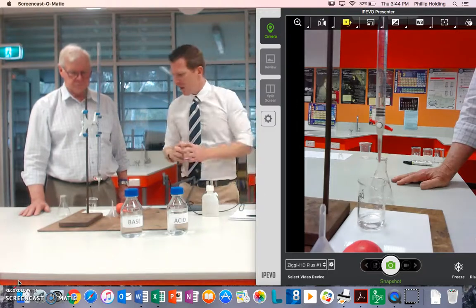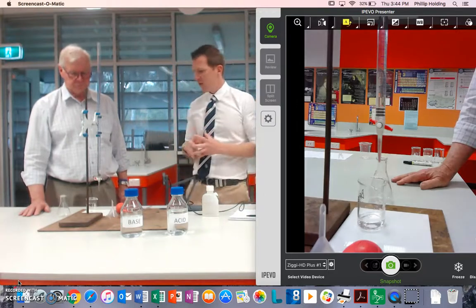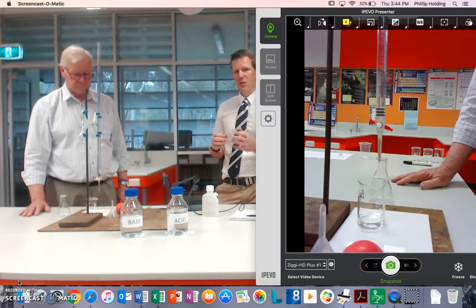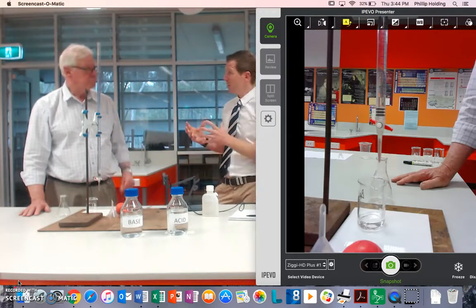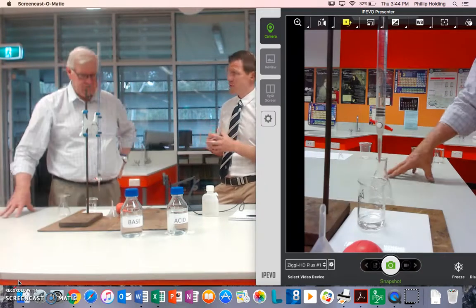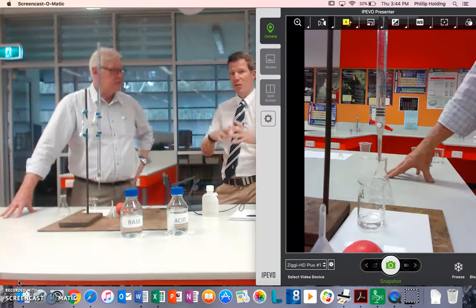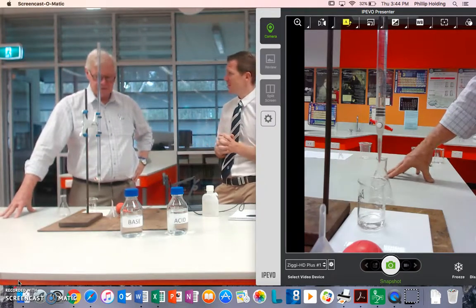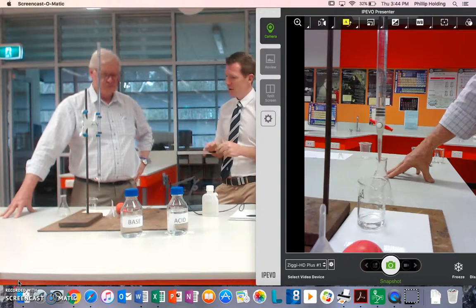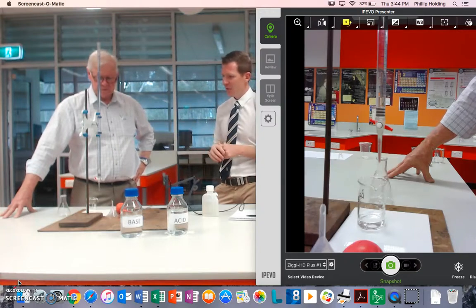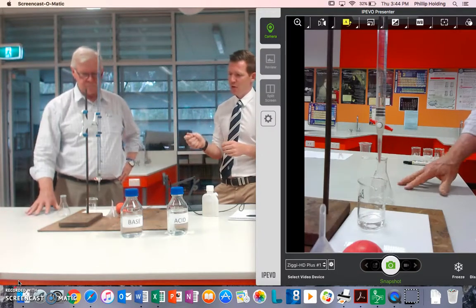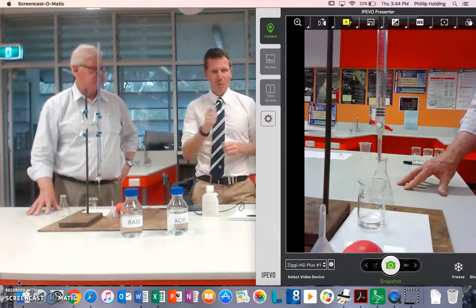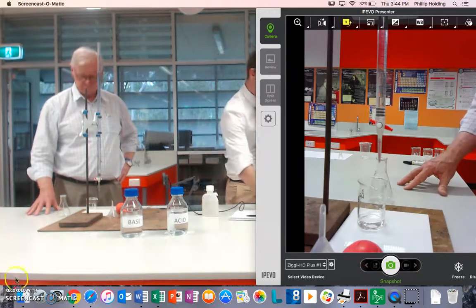Fantastic. So whether you do it left or right-handed is fine, as long as you're doing it. But the other thing you said is do it yourself. So it's not a matter of as much as we like teamwork, not in this case. Yes. All right. That's right. Okay, so that's how we use a burette, how we fill it and how we use it accurately. Hopefully, you found that useful.